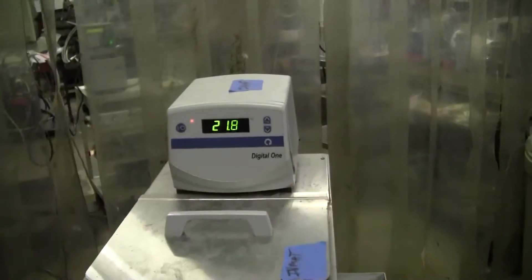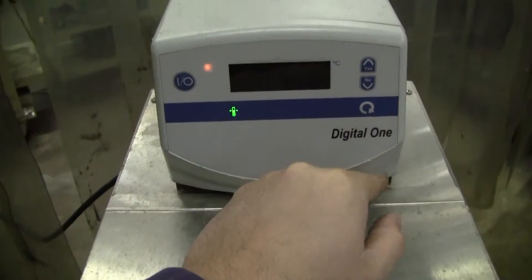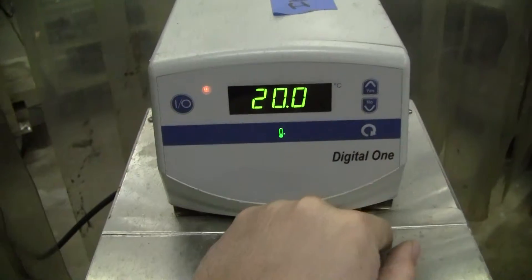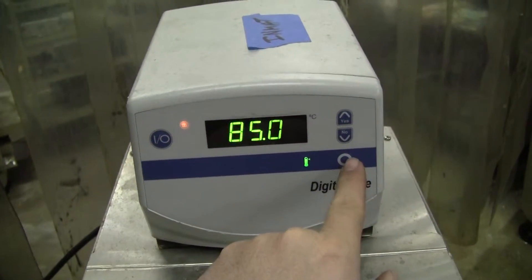This bath goes up to 200 degrees C. Very quickly, you'll scroll through with the set points at 80, the low is at 20, and the high is at 85.